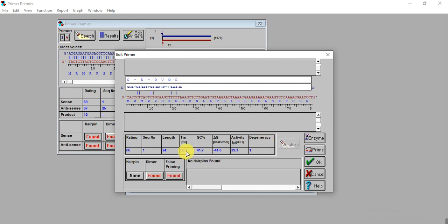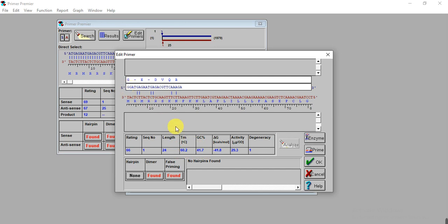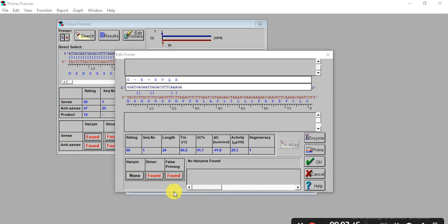The temperature increased up to 60 degrees centigrade and GC content also improved to 41%. Here we removed the hairpin. If all things are okay, then click OK.